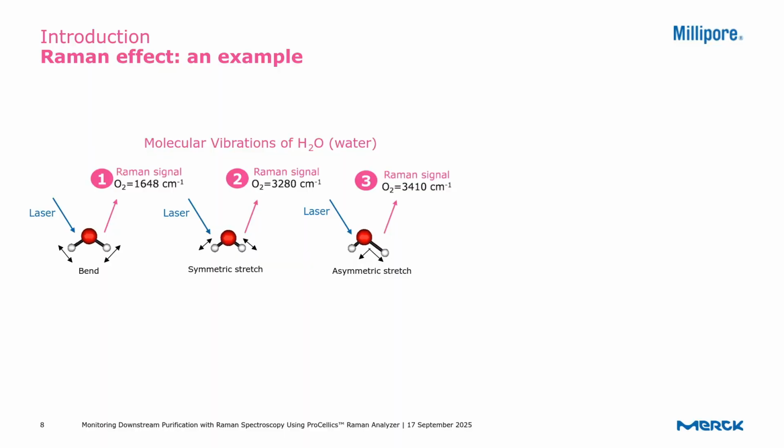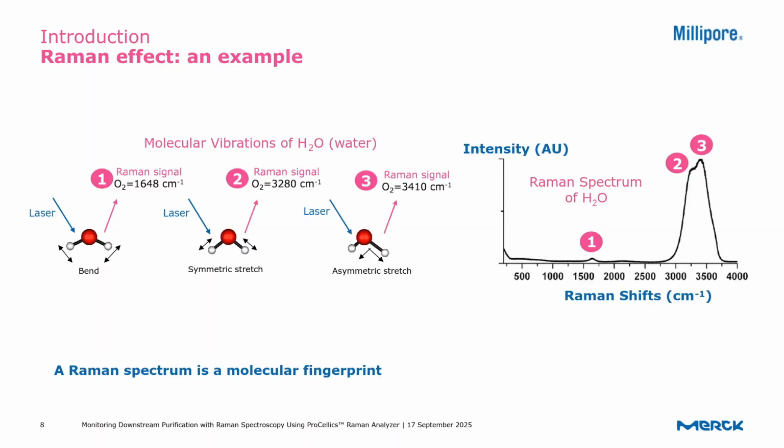The net change of energy can be measured on that Raman shift, as displayed on the graph on the right. So you can see that the specific components have different intensities, but overall they are all being measured independently. It's a significant intensity for water and the specific molecular fingerprint.